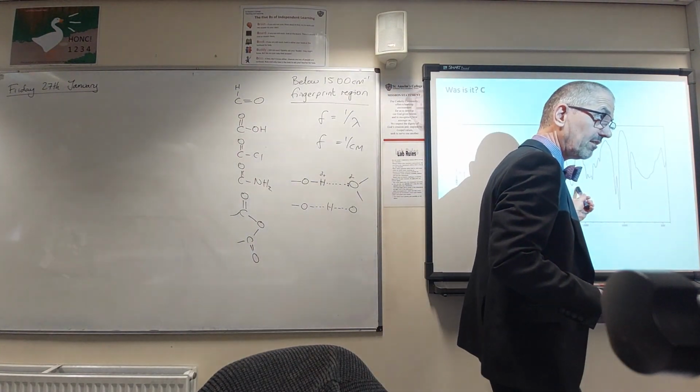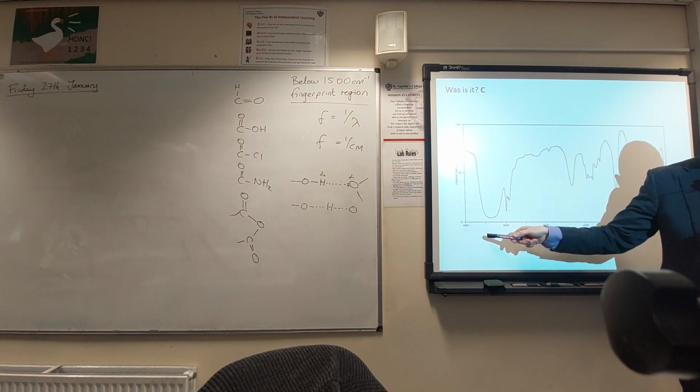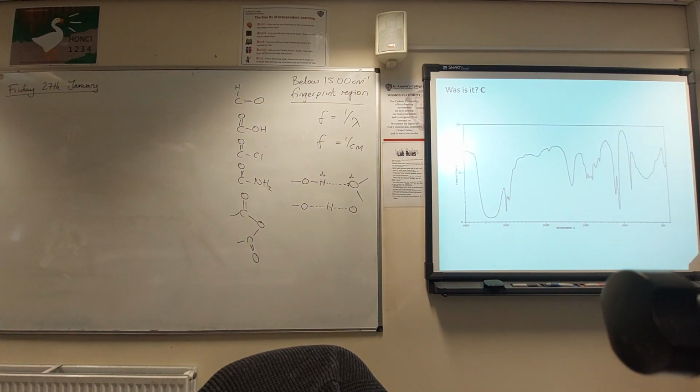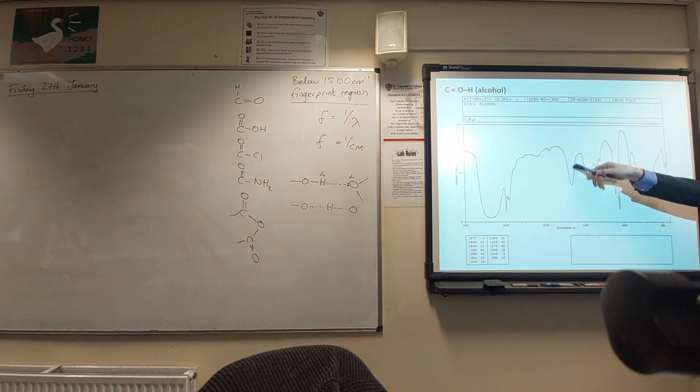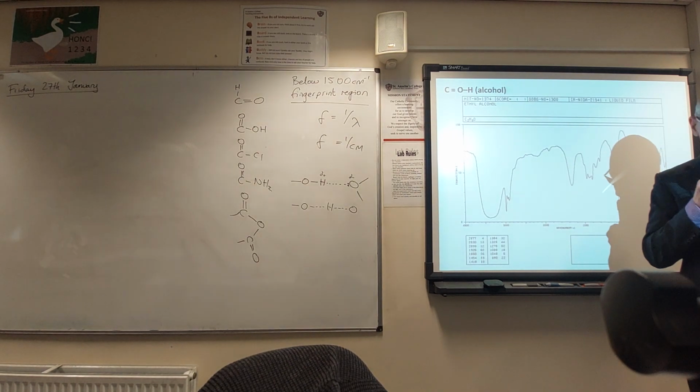Looking at that there. It's confusing that, isn't it? I'm just looking at that and going, well, okay, that's definitely an alcohol. We can definitely take that away. It's actually just an alcohol, and I don't quite know where that's come from. It's actually just ethanol. But that's around about 1650, which kind of doesn't really.